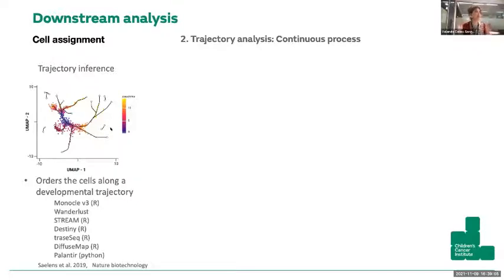And one thing here is that this is called, they like to use the word pseudo-time trajectory because it's kind of the process over time. But to actually set the time, so what goes first and what goes after, you need to know either because you have done a temporal study and you know which cells are supposed to be first and which cells are supposed to be later, and then you can say, okay, so this cluster here have my early time point, this cluster here have my late time point, so I know this is the direction.